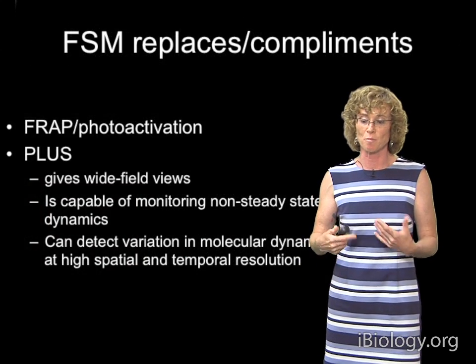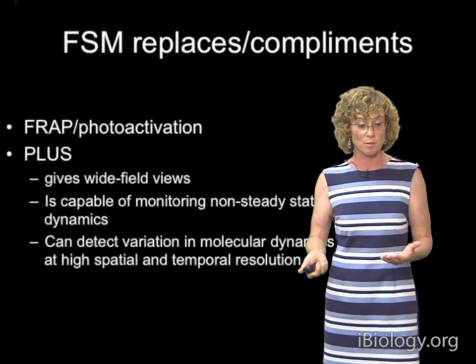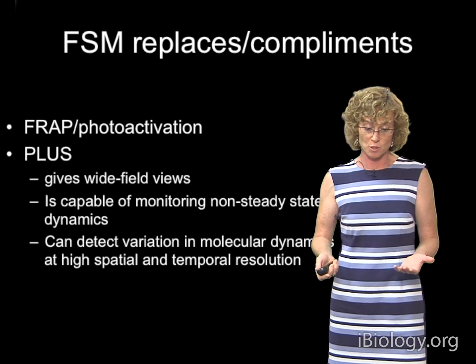We have techniques for measuring the dynamics of protein macromolecular assemblies in cells with a light microscope.